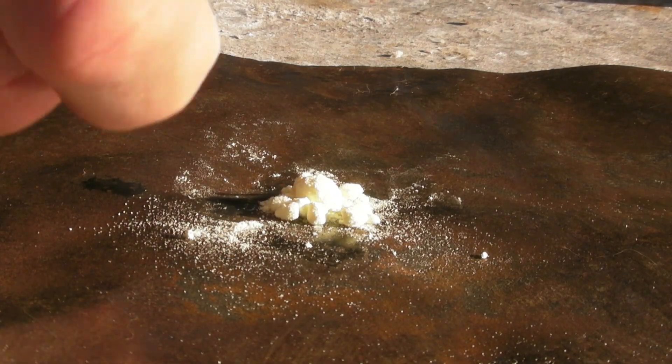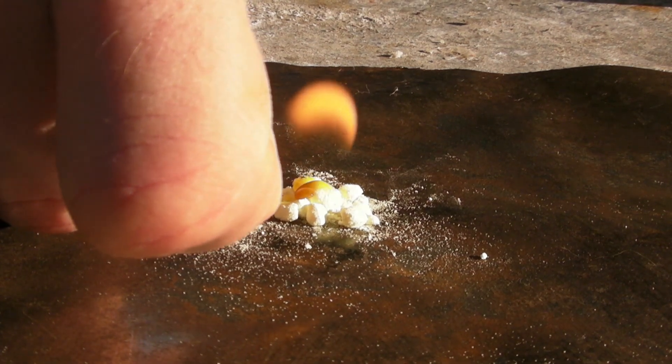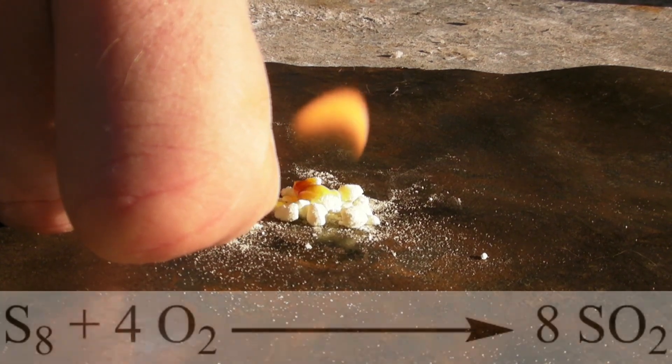When sulfur is ignited, it burns from the liquid with a flame that is not visible in daylight. The sulfur reacts with oxygen to form sulfur dioxide.